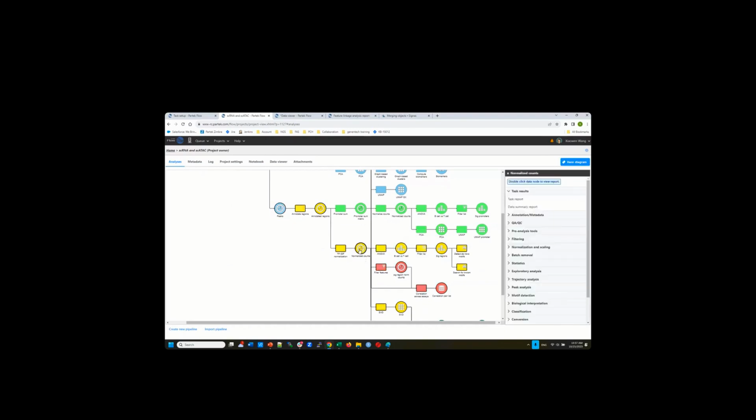You can download it by clicking on any circles, but it's going to be huge, and the values will be in log space. So this is a different type of normalization. In this field, everybody is using it. If you want to try, you can try other normalizations too.